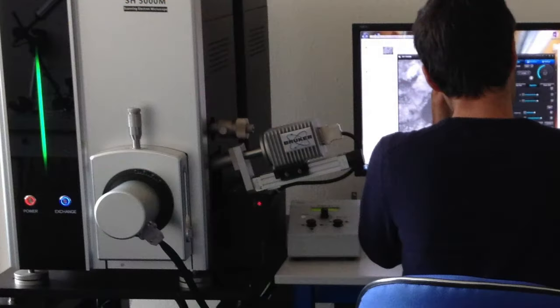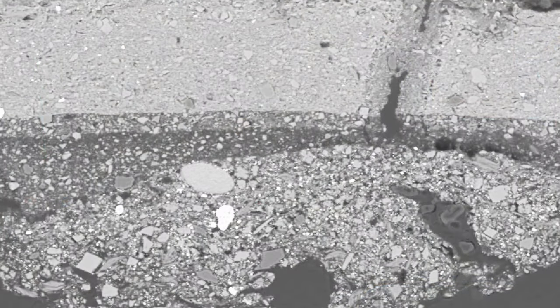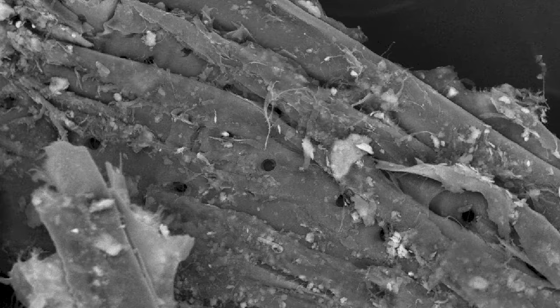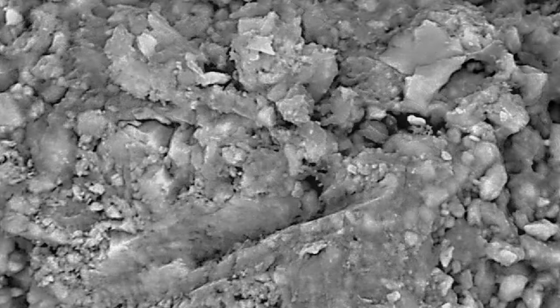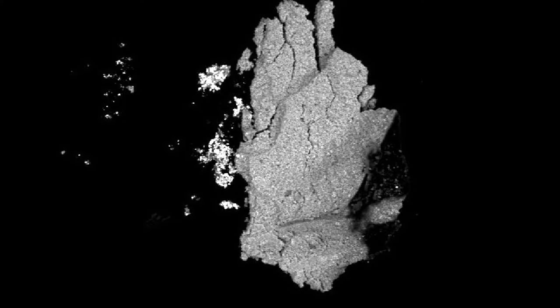We have also, of course, the stratigraphic cross-section image, but the SEM analysis provides several other pieces of crucial information in addition to that provided by the image of the stratigraphy. The magnifying capabilities in this technique are such that we can see the shape of the material's particles, which are often characteristic of an era. For example, the pigment grinding technique may have been manual or mechanical, or of a particular chemical element.